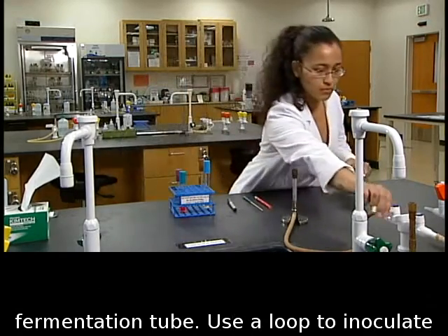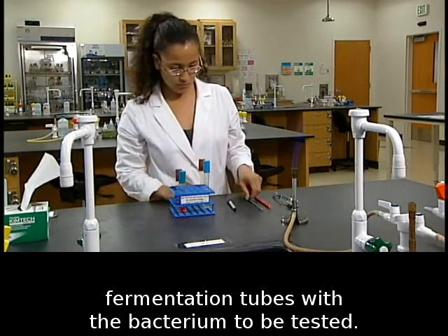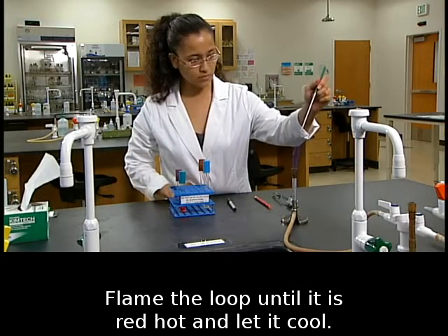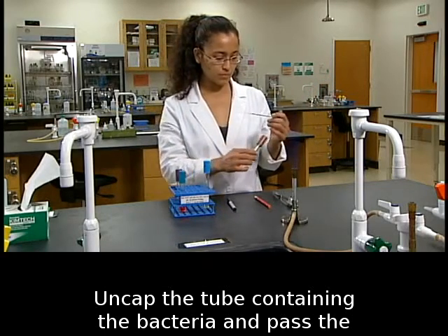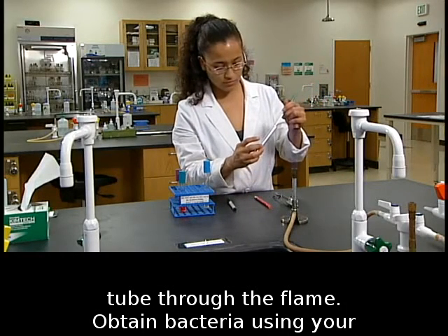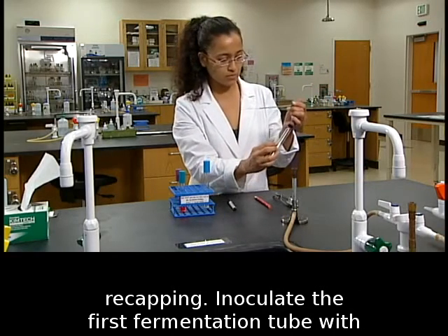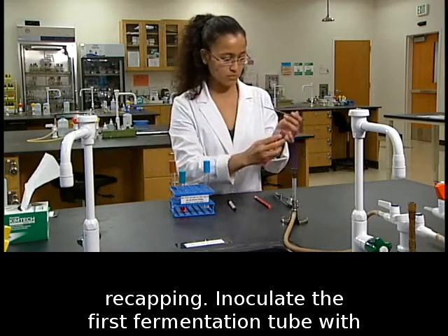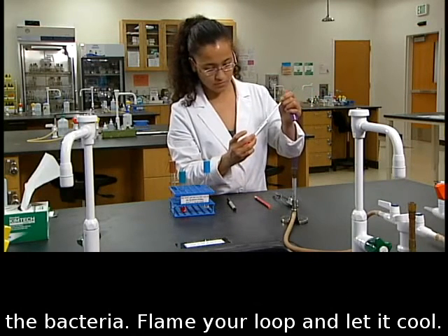Label each fermentation tube. Use a loop to inoculate fermentation tubes with the bacterium to be tested. Flame the loop until it is red hot and let it cool. Uncap the tube containing the bacteria and pass the tube through the flame. Obtain bacteria using your loop and pass the tube back through the flame before recapping. Inoculate the first fermentation tube with the bacteria.